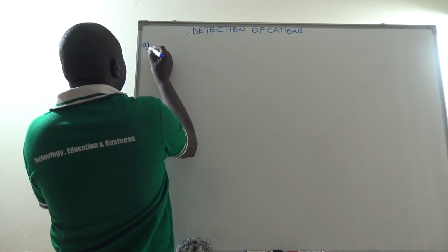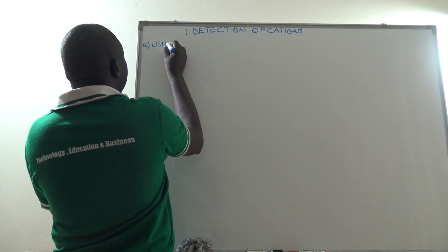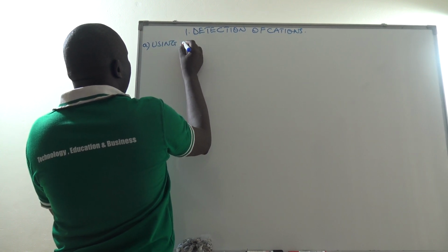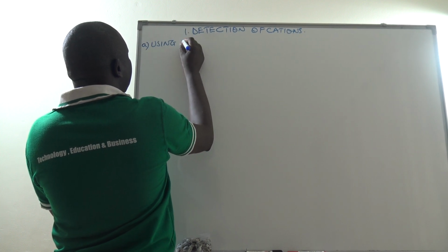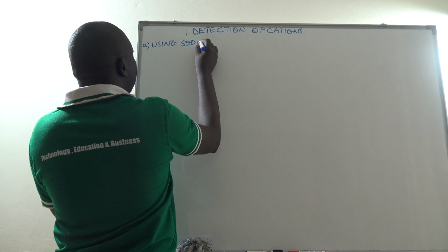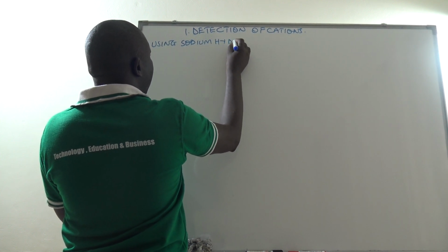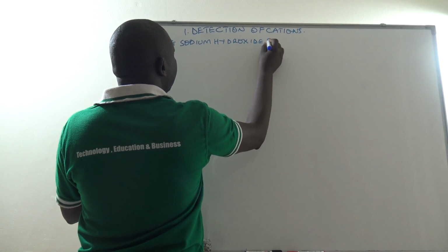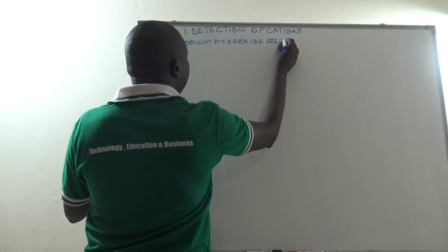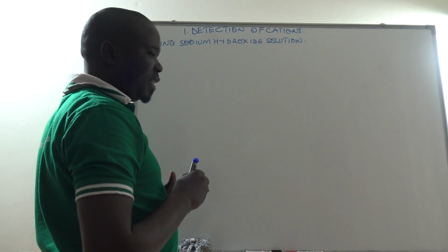So in this case, let us start with the use of sodium hydroxide solution as our major reagent.